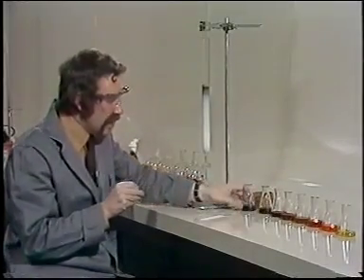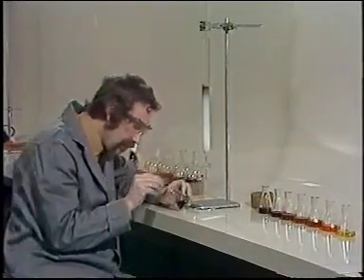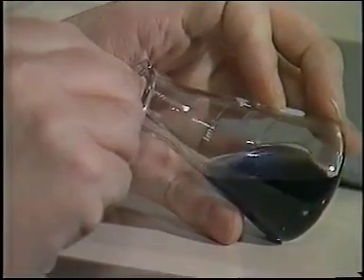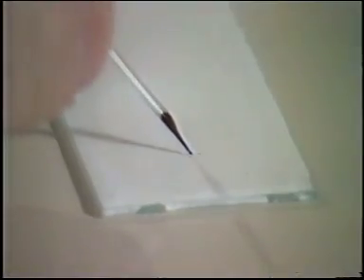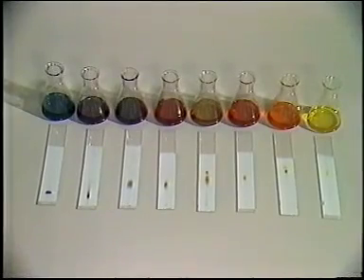This mini plate is just the same as the larger plates we were using. We've done that for all the fractions, and you can see the results on the mini plates. Fractions where the plates show a single spot can be taken away and evaporated to yield the product. Those showing more than one spot, the mixtures, are returned for further chromatography.